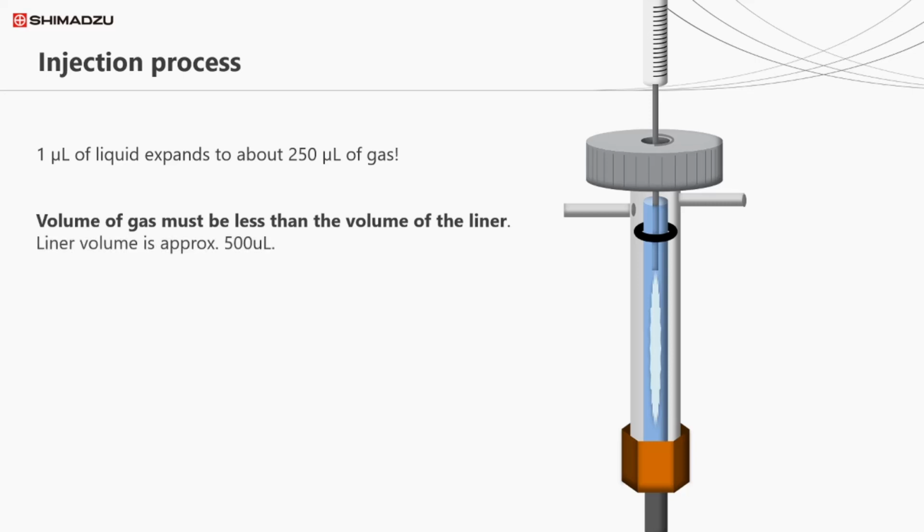So as I said, 1 microliter of hexane expands to 250 of gas under common analytical conditions. This is fine, 250 is less than 500, so we're well below the maximum volume of the liner. What happens though, if instead of hexane we used a more polar solvent like water or methanol? Well, in this case, 1 microliter of water expands to nearly 2,000 microliters of vapour. This is hugely greater than the volume of the liner.